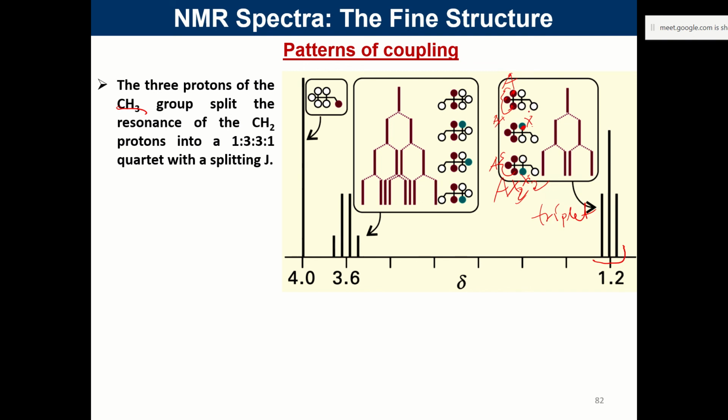So this first nucleus of X, second nucleus of X, so AX2, and so hydrogen, the green one, indicating the interaction with the first proton, which is CH2 methylene. So these two are CH2 protons. So the first proton of CH2, the second proton of CH2, and so AX2 type systems that we are considering here. And so all the 3 methyl groups are equivalent, they are affected equally.